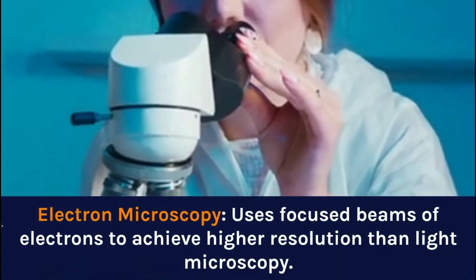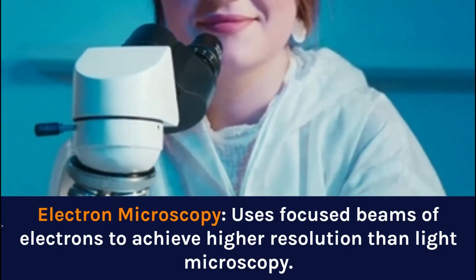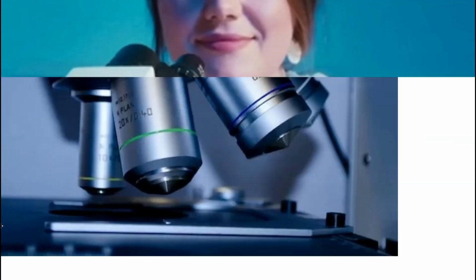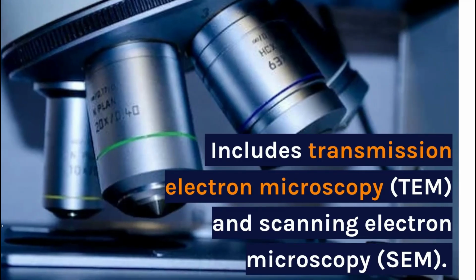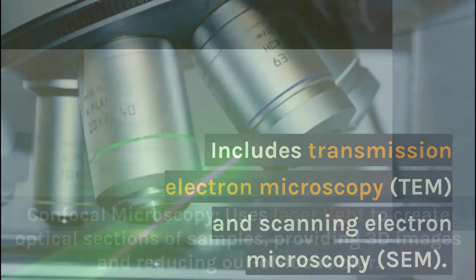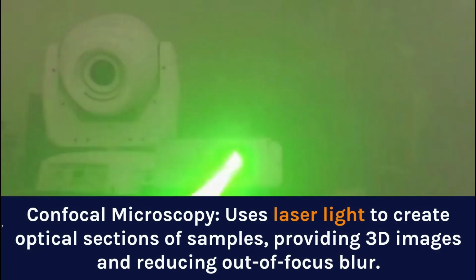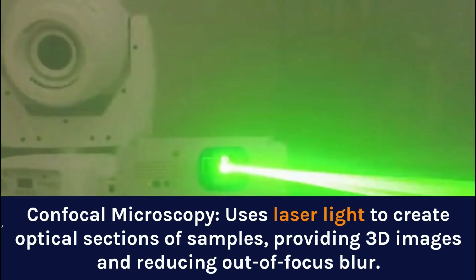Electron microscopy uses focused beams of electrons to achieve higher resolution than light microscopy. It includes transmission electron microscopy, TEM, and scanning electron microscopy, SEM. Confocal microscopy uses laser light to create optical sections of samples, providing 3D images and reducing out-of-focus blur.